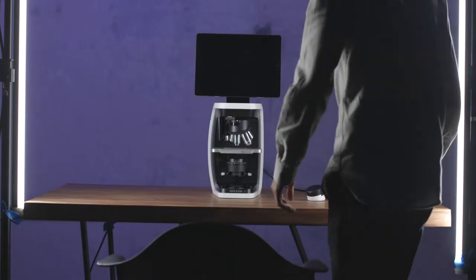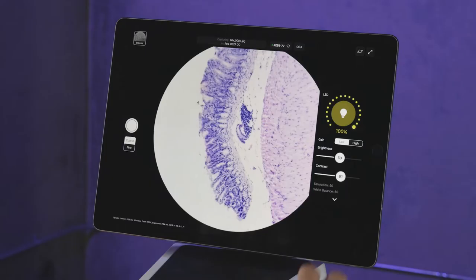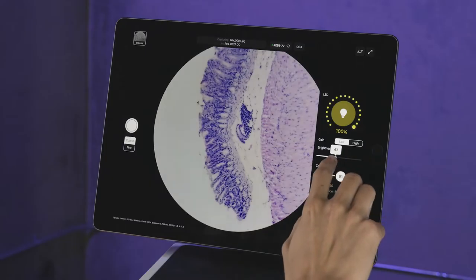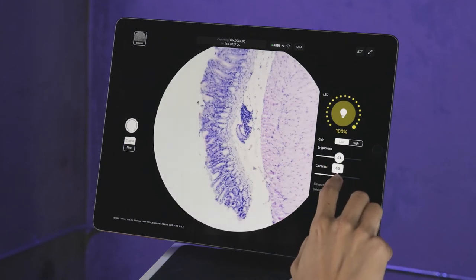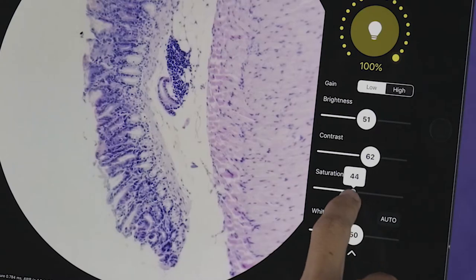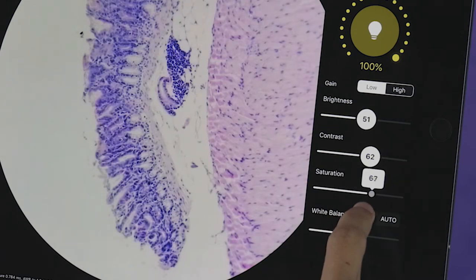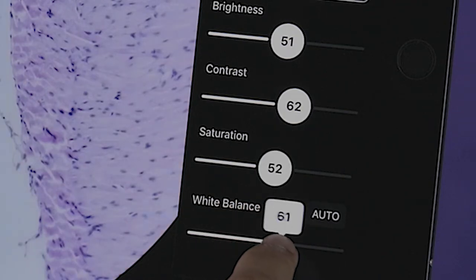Let's get started. To begin imaging, we'll first open up our app. And now you'll see a full field of view captured by an 8-megapixel CMOS color camera. REBEL's interface provides the most common adjustments on these easy-to-use sliders, such as brightness and contrast, as well as saturation and white balance.